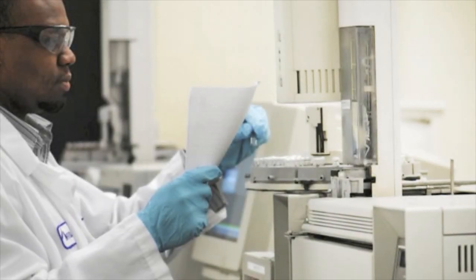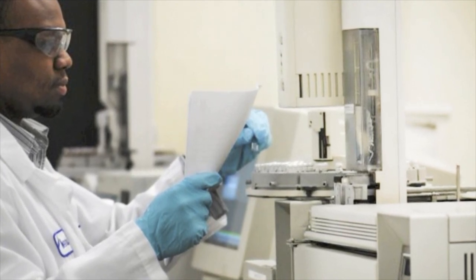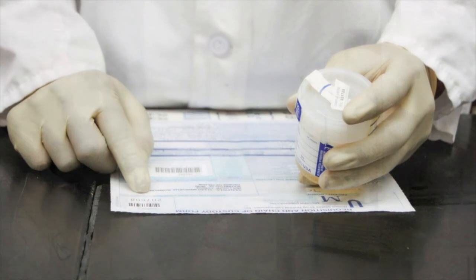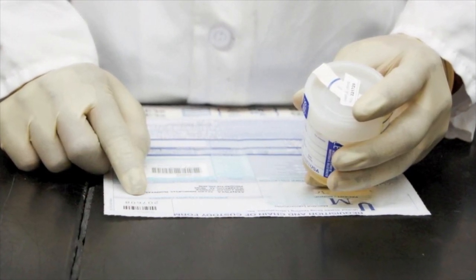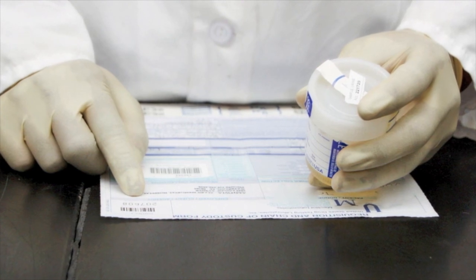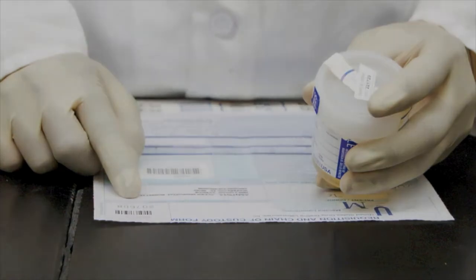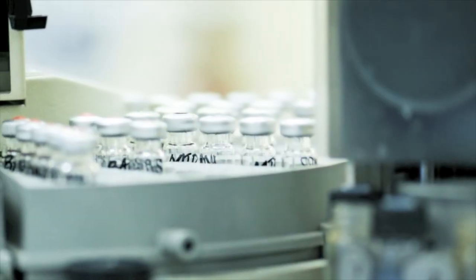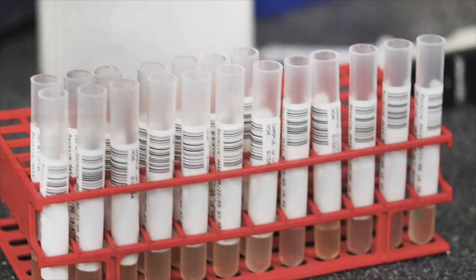Once accessioned into the LIMS, each specimen container is verified against a work list pulled from the system. Similarly, all requisition forms are reviewed against work lists generated from the LIMS. These review steps are conducted after all specimens have been received for the day. Each specimen forwarded to the initial testing section is identified by barcode label.